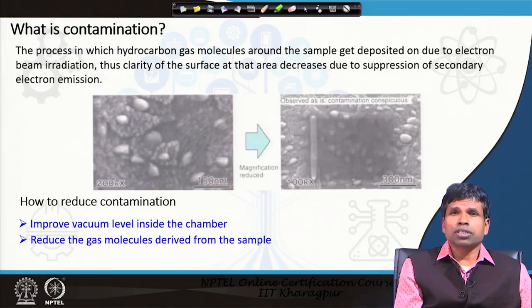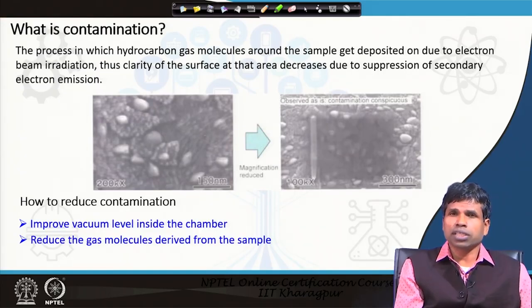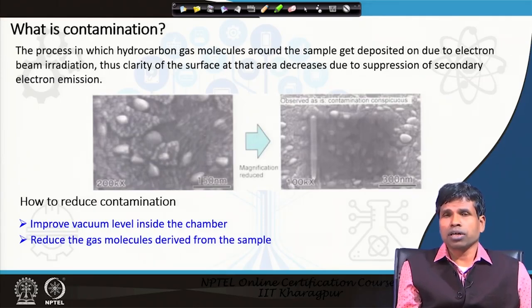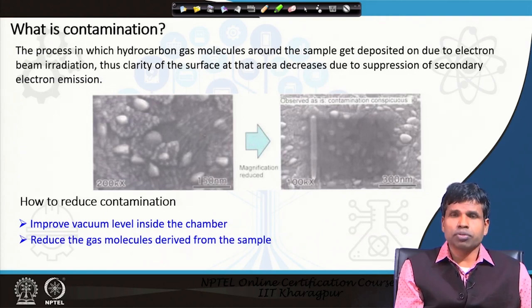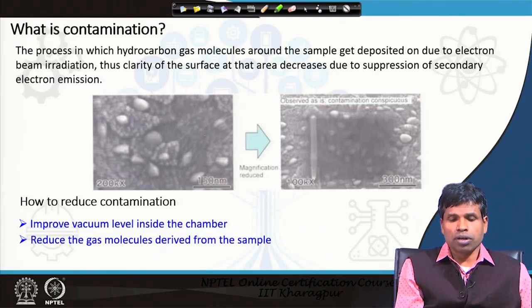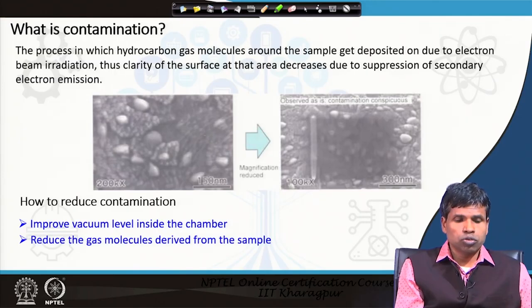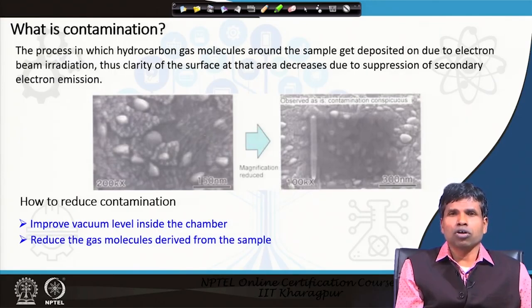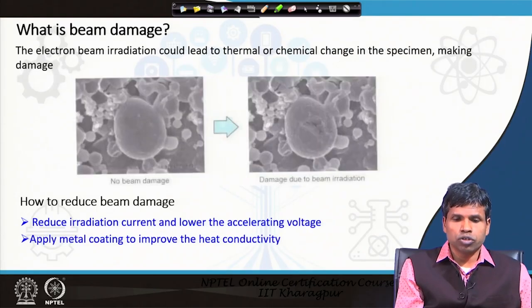In order to reduce contamination, we can improve the vacuum level inside the chamber — if the vacuum level is high, we can remove hydrocarbon molecules from the chamber and deposition will not occur. We should also reduce gas molecules derived from the sample itself. Some samples can also produce gas molecules, so we should use the adhesive tape or conductive paste in a manner that does not produce gas molecules. In this way contamination can be reduced.